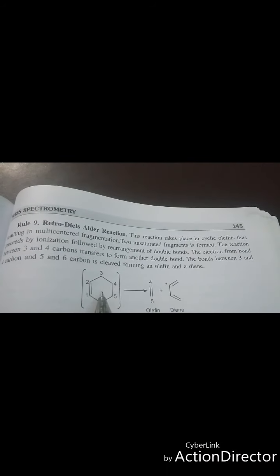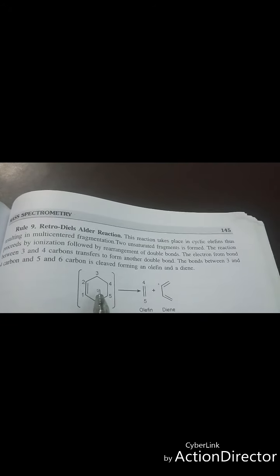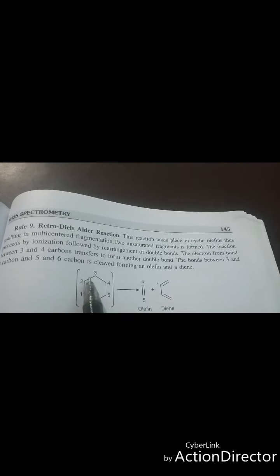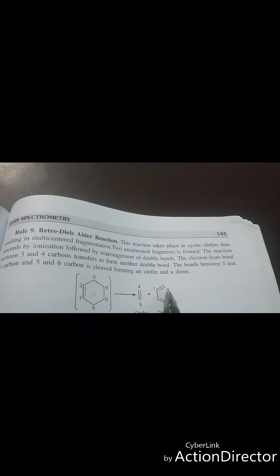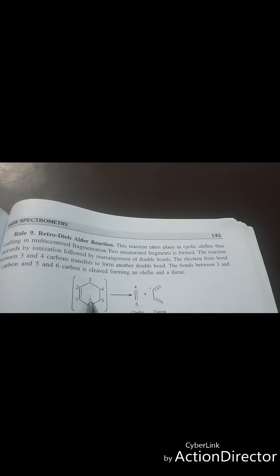This one is the retro Diels-Alder reaction, which takes place in cyclic olefins and results in a multi-centered fragmentation. That is, this bond will break and shift here. Again, this bond will break and shift here. So two unsaturated fragments will be formed. This reaction proceeds by ionization, followed by the rearrangement of the double bonds.